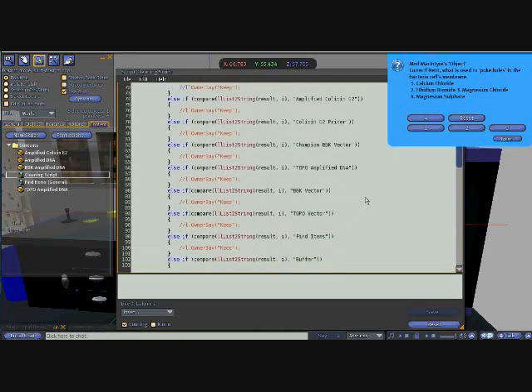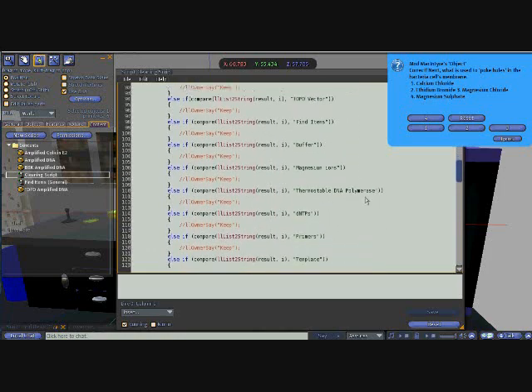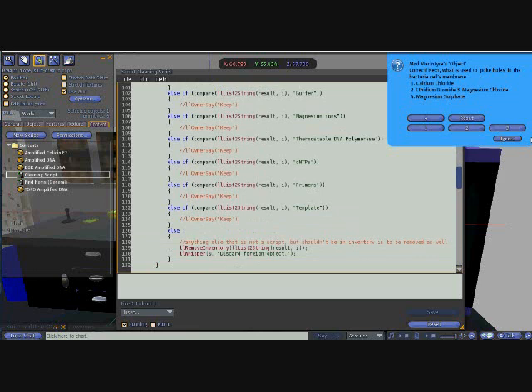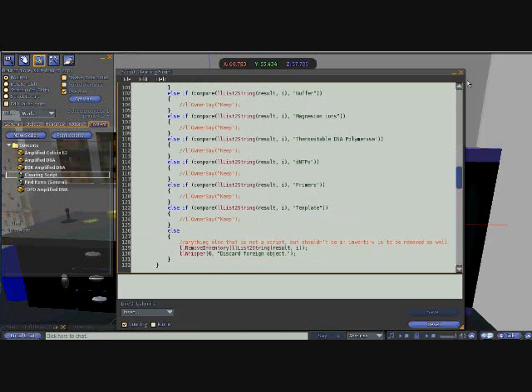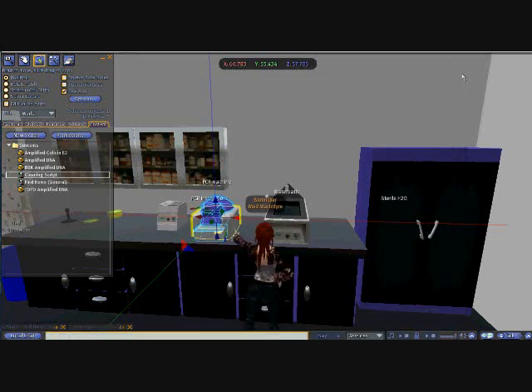Everything that is within a conditional is something that you want to be kept within the inventory. Anything else will be removed that it finds, and we'll just ignore that for now.